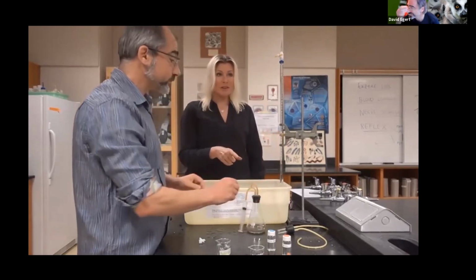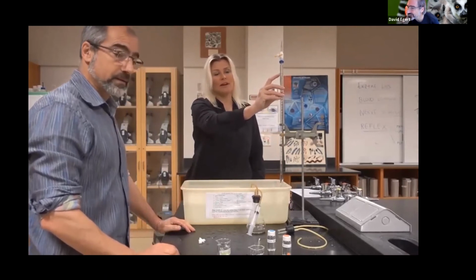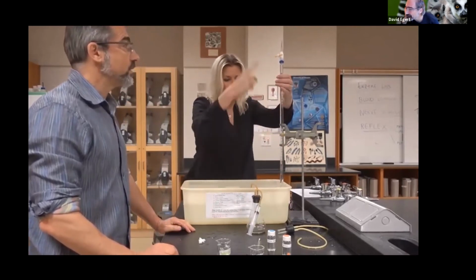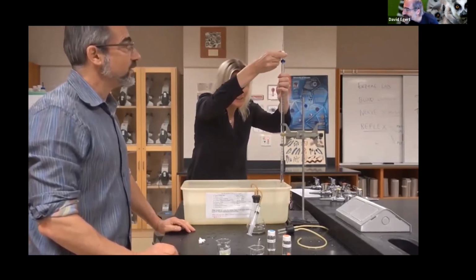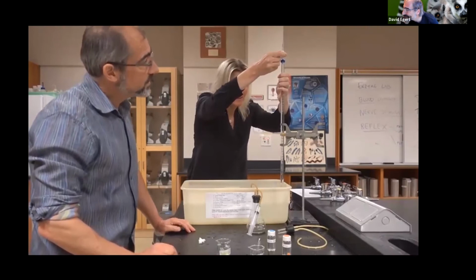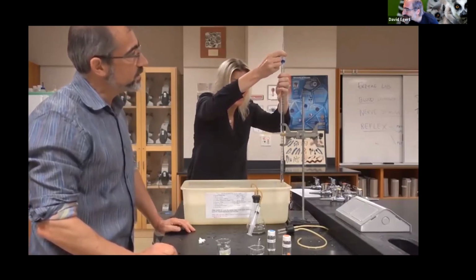All right, so before we start, we also need to zero the water level, now at 50. And so we fill the whole burette. So you just gently twist it, and you're going to get the water level to go down slowly.